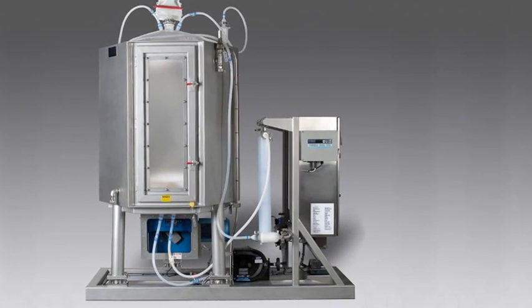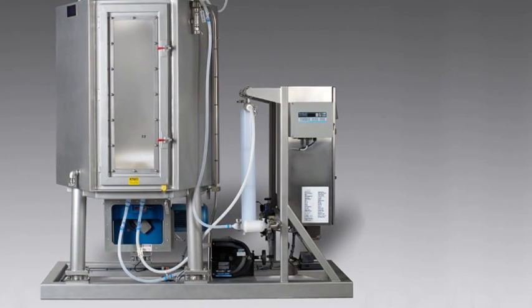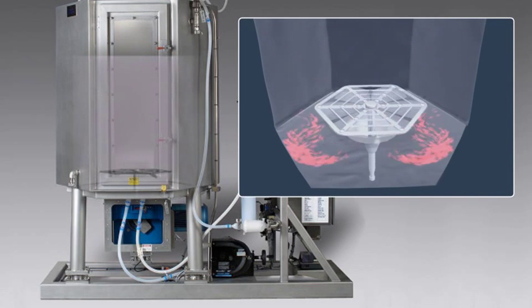Turbulence created by interaction between the vessel shape and the disposable mixing unit pulls materials into the fluid stream.